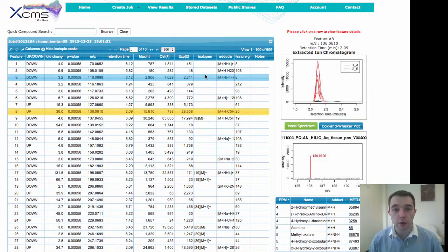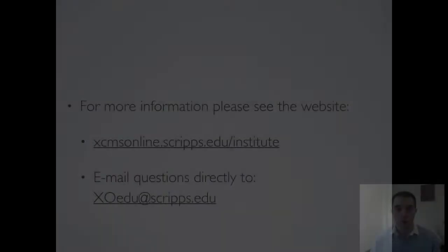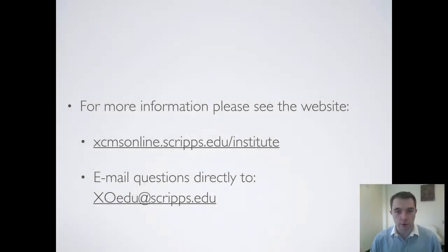This is normally a very good idea to do after your XEMS run to make sure that the peak that XEMS picked up is a real peak. Thank you very much, and for more videos please check out the rest of the XEMS online website.